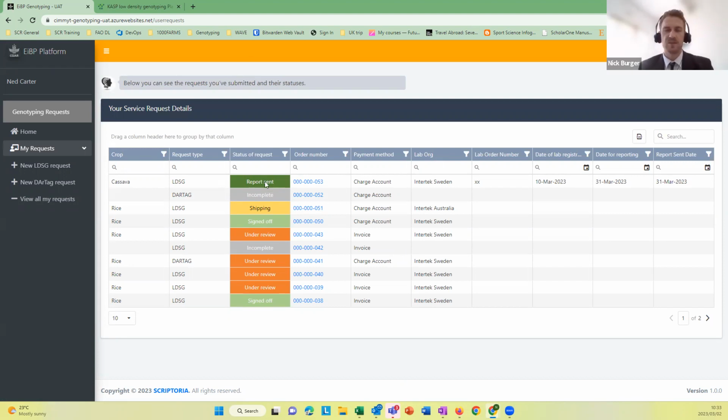So here I can see the sort of full life cycle of this process from end to end, and where information is required from the service user. Great. Right. I know that's a lot to cover in a short space of time, but are there any questions, comments, any steps that you'd like me to repeat, or any information that I should clarify?